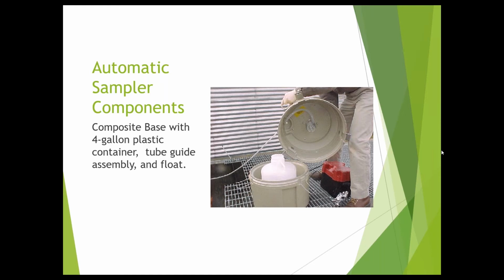So basically, if the container gets too full, that float will push a sensor in the pump that tells it to stop pumping. This way you don't pump your sample out when it purges and then put the same amount back in when it goes to collect the sample. So that's the whole point.